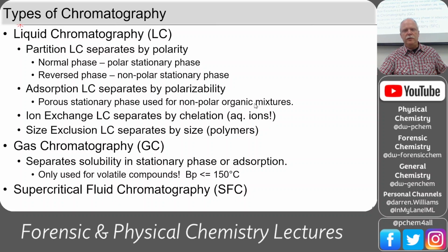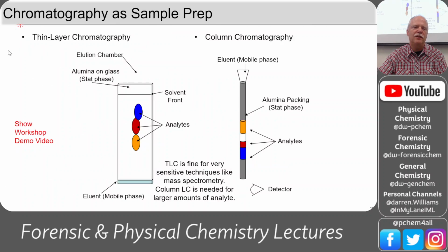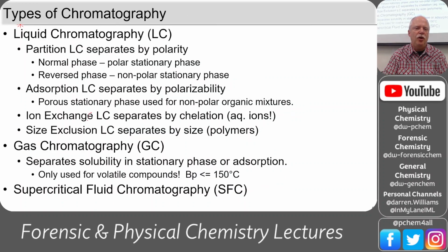Okay, so that's using liquid-liquid extraction. We could also use separations using chromatography. And there's different types of chromatography. Now, you study this in detail in the instrumental analysis course, but we'll just give a quick review over these things. Partition liquid chromatography separates by polarity, and you have 2 common ways of describing this. Let me go back. Normal phase, which really just captures the way this experiment was done originally, where you have a polar stationary phase, typically aluminum oxide.